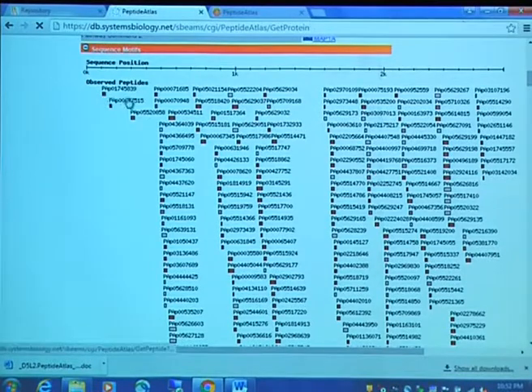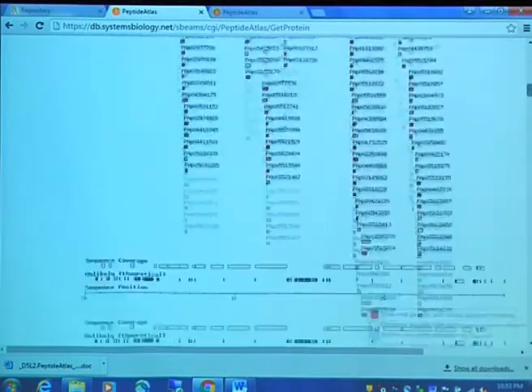So why do you think that might be? Because there are probably no peptides that are amenable to phosphorylation here, which is actually kind of a nice thing. If you find these areas where there are no peptides, when you do phosphoenrichment, you expect to get more phosphopeptides. But there's nothing that says you can't have regular peptides. Always some peptides come along for the ride. But the fact that we have very distinct peptides here and not everywhere indicates that the purification method is actually pretty robust.